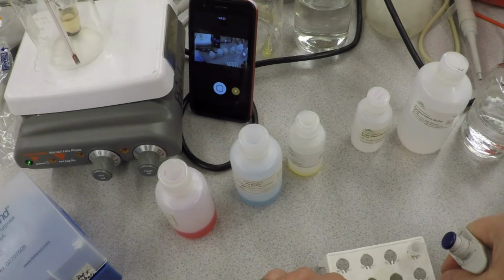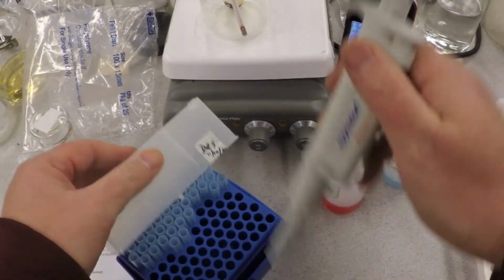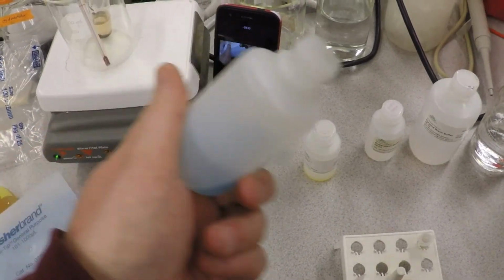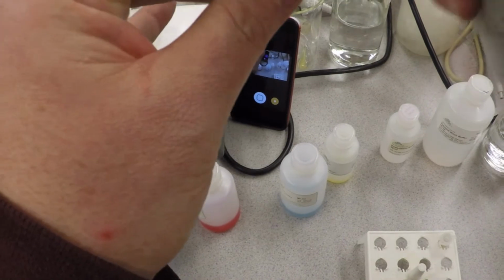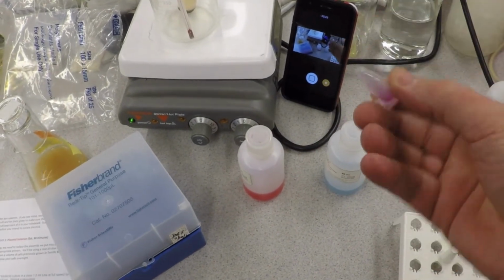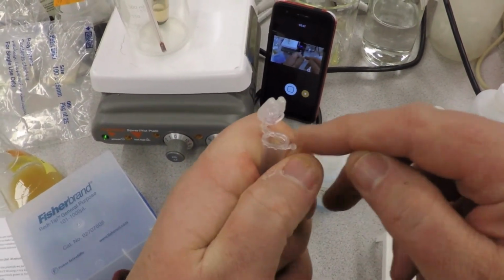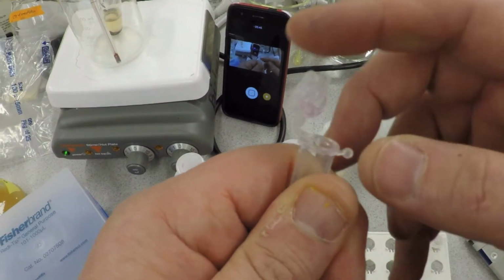Okay. Now it says add 200 microliters of the green buffer and mix by inverting 2 to 4 times. So what you're doing is prepping this for lysis, and now you're going to lyse it. Lyse the cells and get all that goodness out. So I'm going to put that in. And right now, they're being lysed. And all their DNA and things is being loosened, pulled out from the body of the little bacteria into the solution. And you can tell this is mixed because when I open this top, you should see a stringy, see that stringy stuff there? That is nucleic acid, more than likely. You see that little gooby string? Okay, so that means they're lysed.